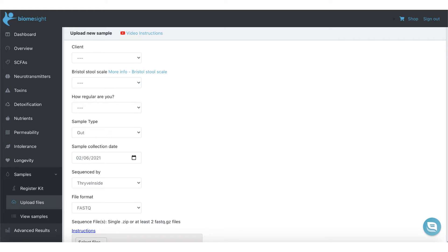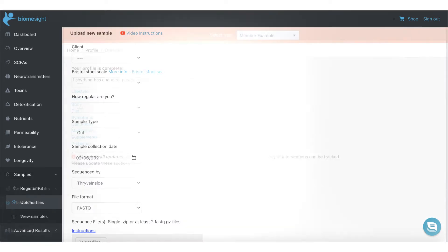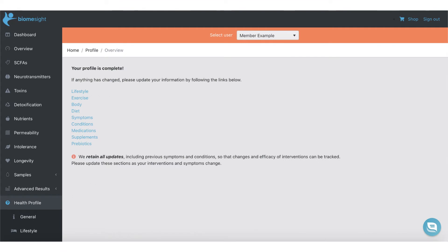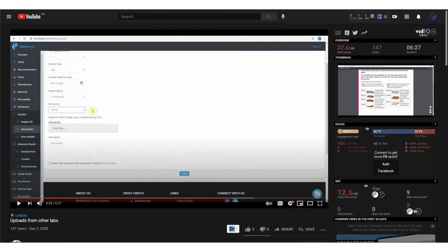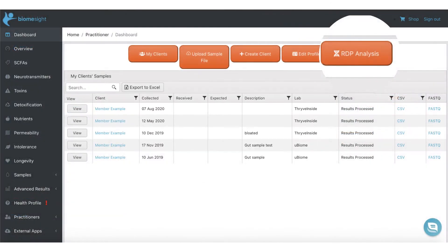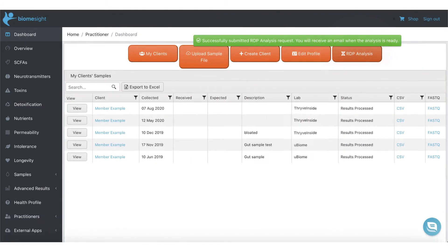We support the processing of 16S rRNA sequence samples for regions V3, V4, or V3-V4. This process will take around 10 minutes to complete. Furthermore, you can request an additional analysis using the RDP analysis pipeline. RDP gives you an alternative analysis using a different sequence database.